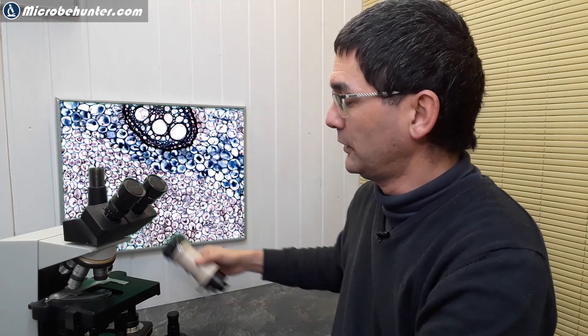I can, by defocusing, get pretty much any image into the camera. But I do not want that it's not par focal. The reason is, if I just detach this here and show it to you, what happens is the following. In the photo tube, the image, the objectives, they project an image around one centimeter down into the photo tube. When I have a camera up here and the sensor is up here, I have to move the image out. I can only do that by turning the coarse focus knob, lowering the stage, and then I will move the image out. That's something I do not want to do. For me, this is not negotiable because I really lose image quality this way, because the objective and the specimen are now further away from each other. The objectives do not operate at their design distance and you also lose resolution this way.